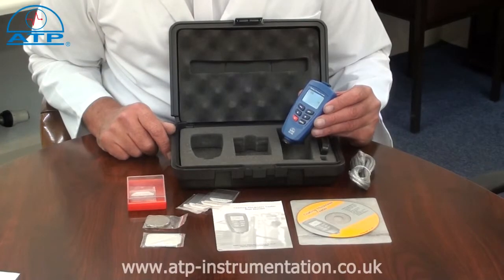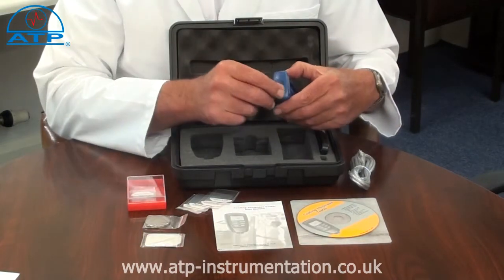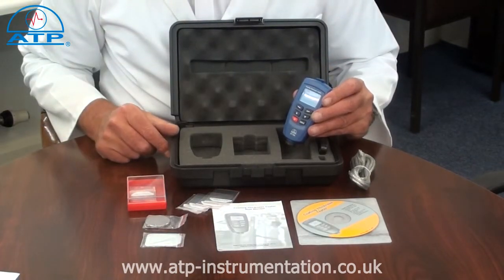The memory has a capacity for up to 400 measurements. Download of log data is easy — just connect the USB cable to the instrument and the computer, open the software program, and click download.